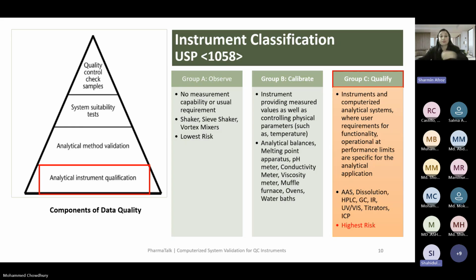In the case of pH and conductivity it is the same; we perform the check, say at 82 or 84 microsiemens, before operation. If you don't use it for 7 or 8 days, you do not need to check the performance daily, but before your analytical activity, you have to check it.